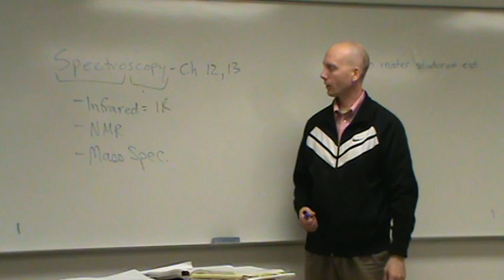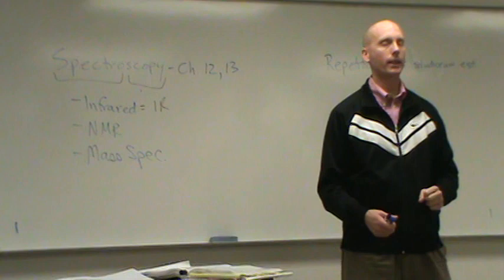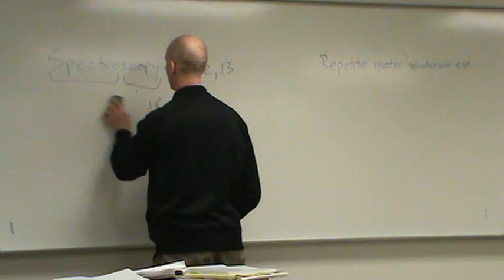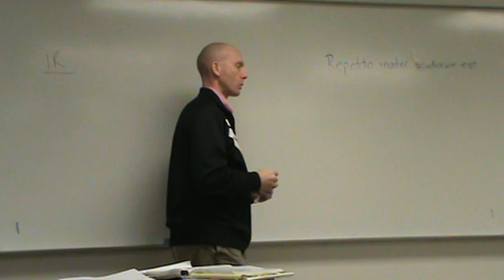Okay, so what we're going to do is study infrared first. Why? Because that's the easiest one. And then we'll get to these harder ones later on, okay? So let's go ahead and tackle infrared spectroscopy. Or we'll call it IR spectroscopy, mostly.